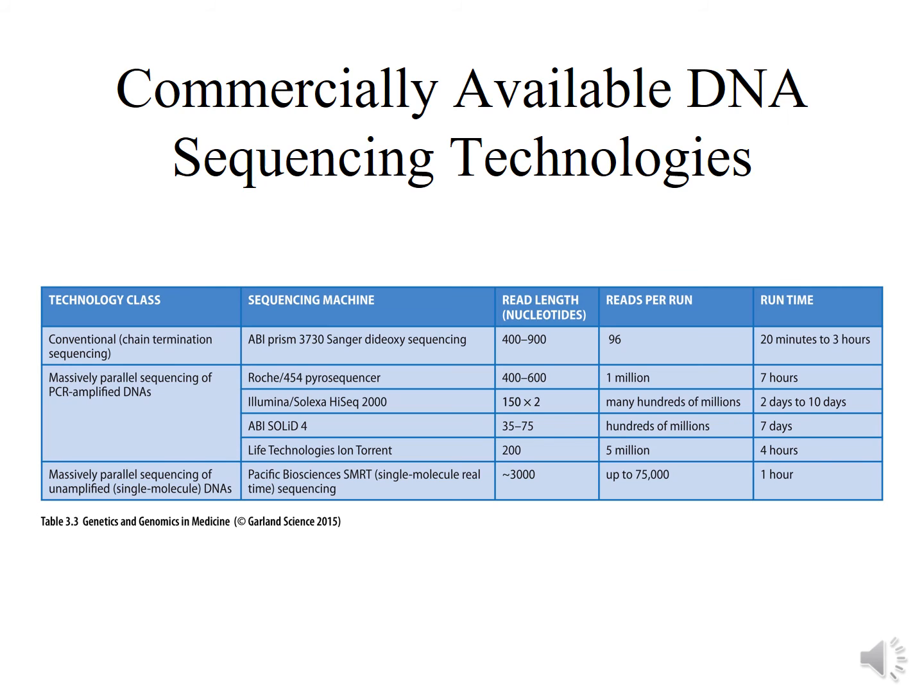That is, the sequencing method was able to monitor the incorporation of each nucleotide in the growing DNA chain and to identify which nucleotide was being incorporated at each step. The new sequencing technologies, often referred to as next-generation sequencing, or NGS, represented a radical step change in sequencing technology.